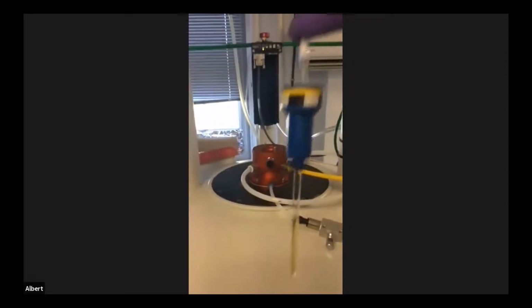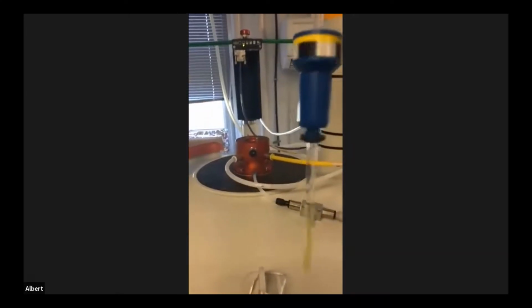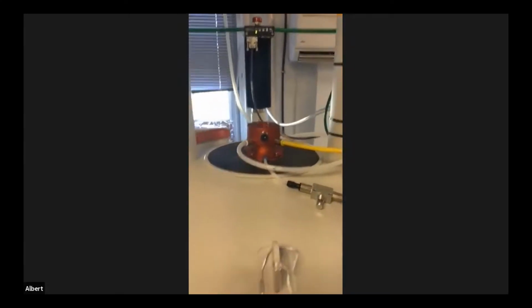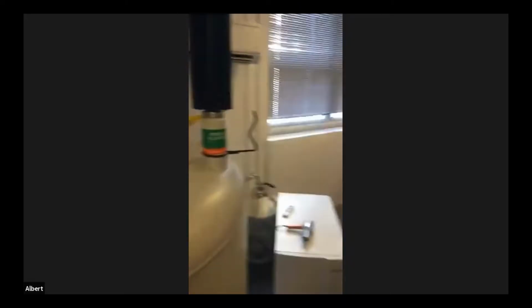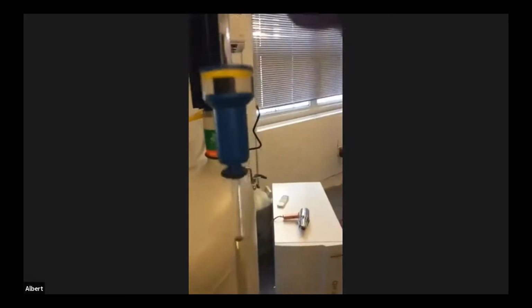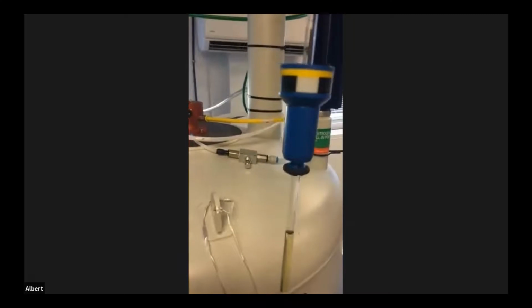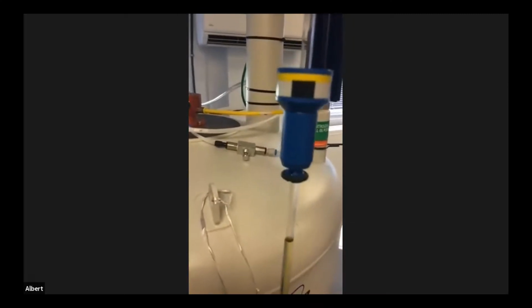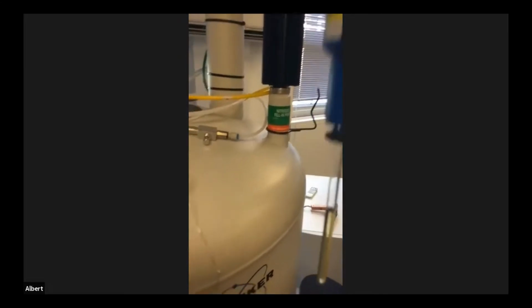And you see it, the sample is in a spinner. And the spinner kind of has a pattern on the top. That's on purpose. Because when you put this into the instrument, you have to spin the sample so that the radiation that's hitting it is homogeneous. It's going to hit it from every angle. So that's the purpose of that little black and white checker boxes on the spinner. And the purpose of the spinner itself is to hold the sample up.